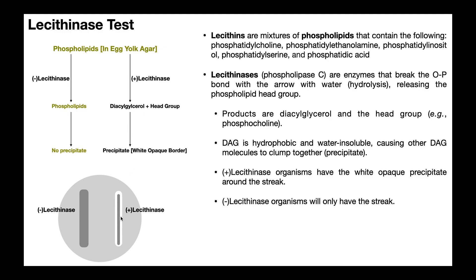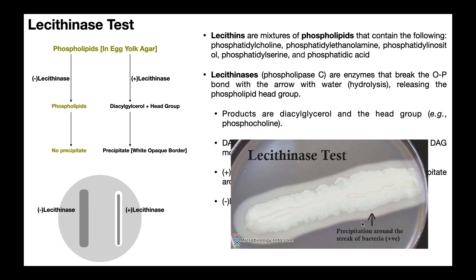The key is: if you see a white opaque clumping border around the organism, you have a positive lecithinase organism. Here's another look at a positive test. Again, here's the lecithinase agar, which is just egg yolk agar. You see the streak here in white, but then you see this white clumping around that entire streak — it almost looks like a halo, kind of like what we saw in the lipase test. And if you see that, you know you have a positive organism.